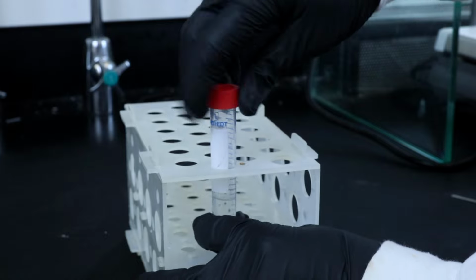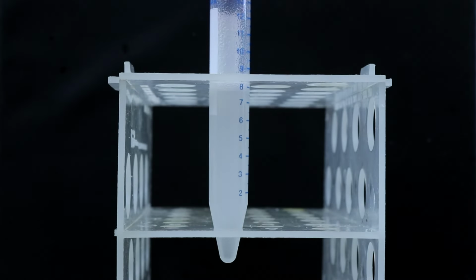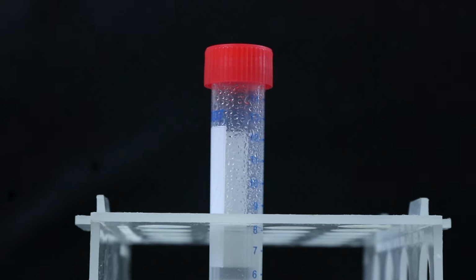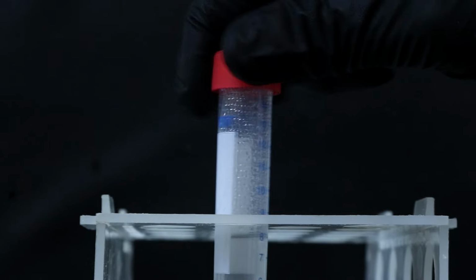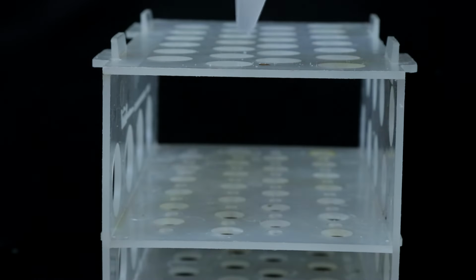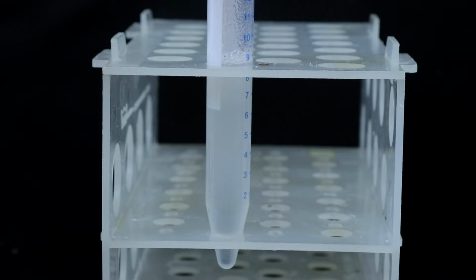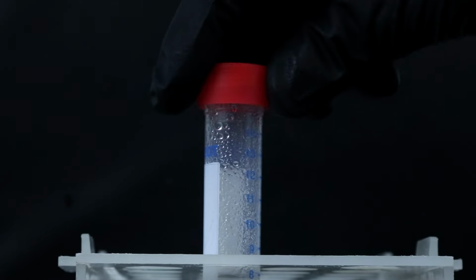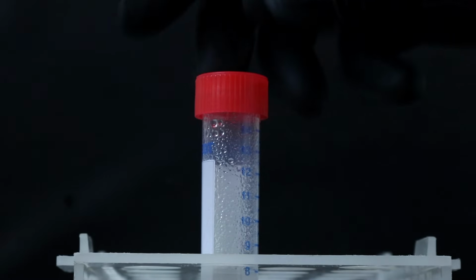Now I'll place the cap on the test tube and shake it up so that the 2 phases can interact together really well. And you can kind of see the CO2 gas coming off as the sodium bicarb reacts with the acid, but I'll also open up the cap and listen for any gas released, and there definitely was some fizzing, so that means the reaction is happening. I'll continue to shake up the test tube a few more times, watching for those CO2 bubbles, and also cracking the cap to listen for the gas. There's only some slight fizzing now, so we're probably good to move on.